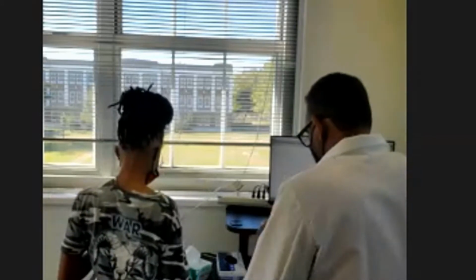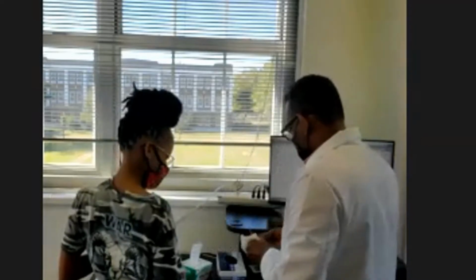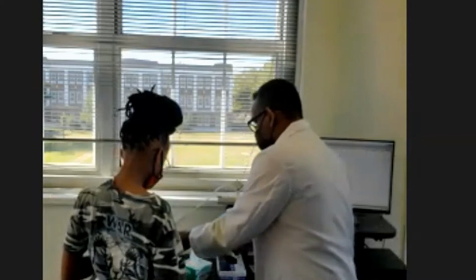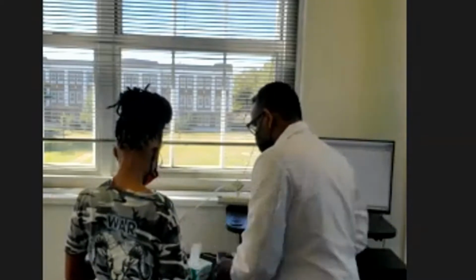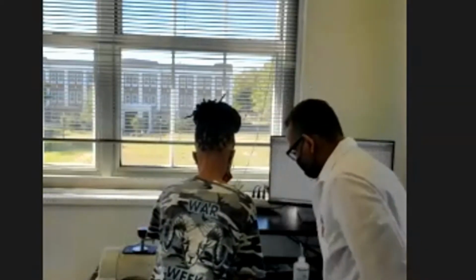So you clean most of them. Okay, clean most of them. Make sure to pick up this again. Clean one more time. Put the sample on the bench. Take a small amount. Cover up the diamond. Okay. So let's try to see if this is there. That's it. Yeah, this is going to be a clean sample.